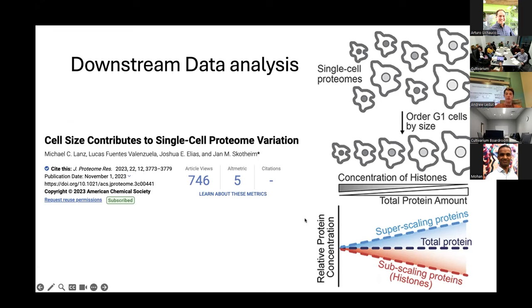And so you might want to correct some of these things in your normalization. It's a bit hard. If you have a very homogeneous population of cells, you could implement something to adjust for these quite easily. But if you have a complex mixture of cells, you might have a specific protein that's specifically expressed, but also expressed in the largest cell type. So you cannot necessarily associate it with cell size. You don't want to just apply some ad hoc normalization algorithm. If it's correlated with size, regress out the size correlation.